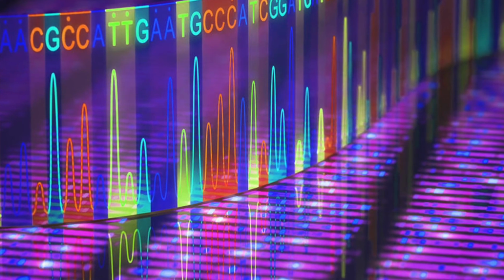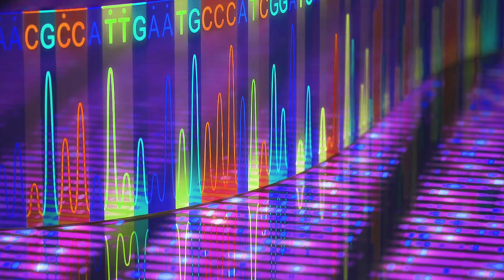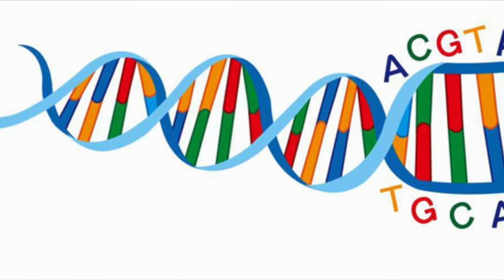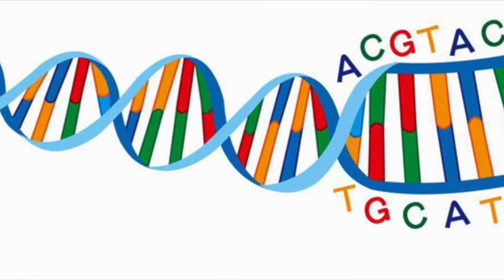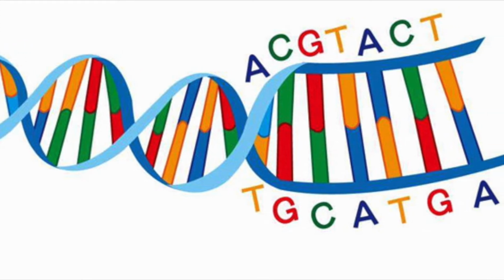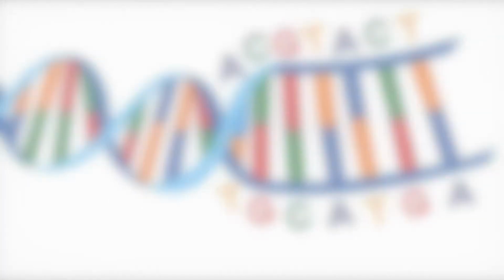At the beginning of sequencing, obtaining the sequences of a fragment of 5 or 10 nucleotides was a very expensive and complicated process. However, scientific and technological advances have allowed many DNA sequences to be obtained today.